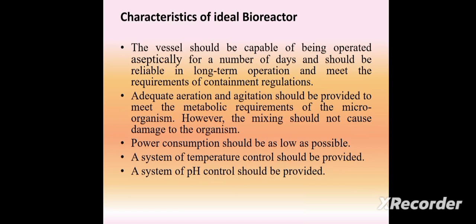Agitation is responsible for proper mixing of the fermentation medium to transfer all the nutrients to each and every cell growing within that medium. However, the mixing should not cause damage to the organisms. The power consumption should be as low as possible, which will reduce the cost.